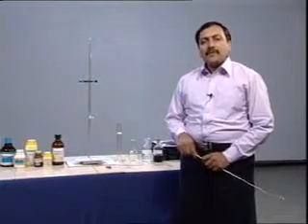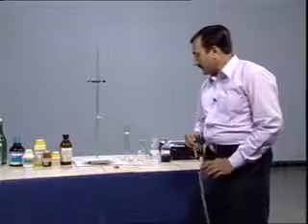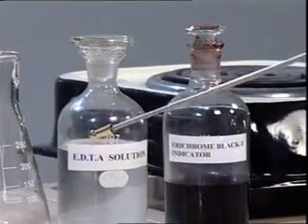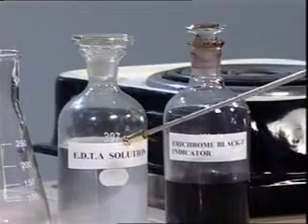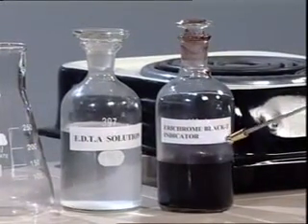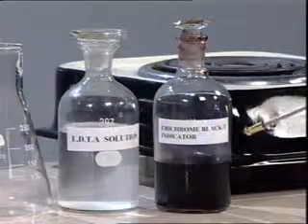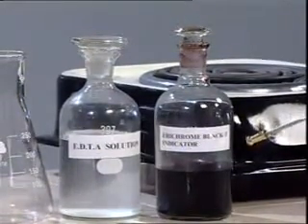Now first we have to prepare reagents of desired concentration. The EDTA standard solution is prepared by dissolving 4 gram of sodium salt of EDTA and 0.1 gram of magnesium chloride in 800 ml of water. To prepare Eriochrome black T indicator, you take 0.4 gram of Eriochrome black T powder and 4.5 gram of hydroxylamine hydrochloride in 100 ml of 95% ethanol.